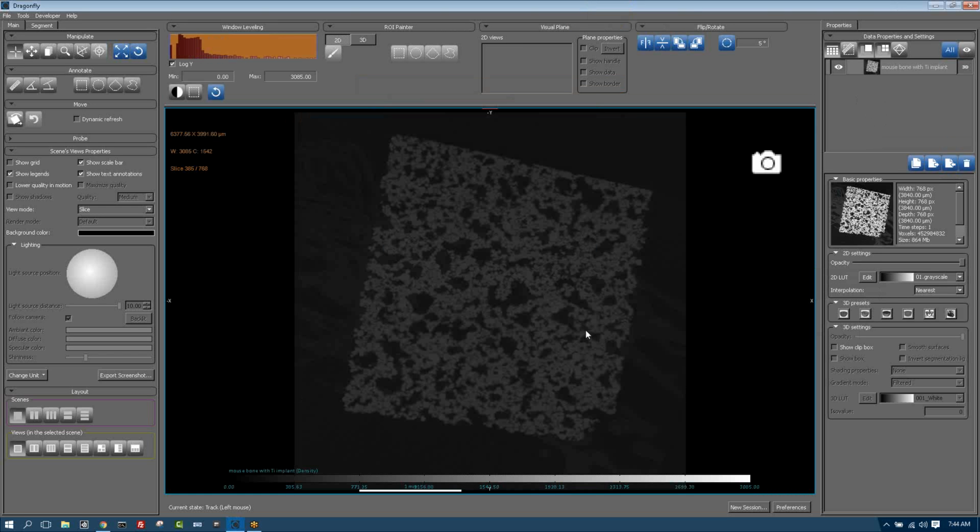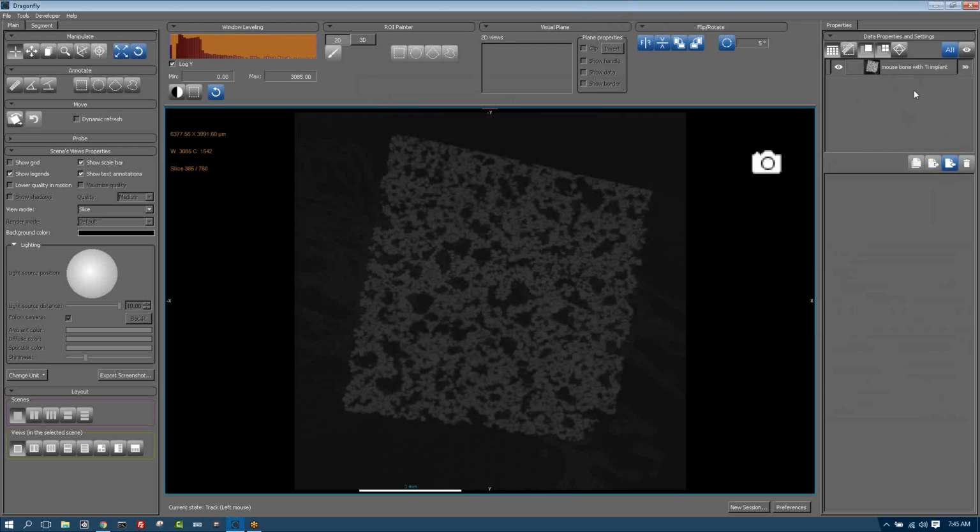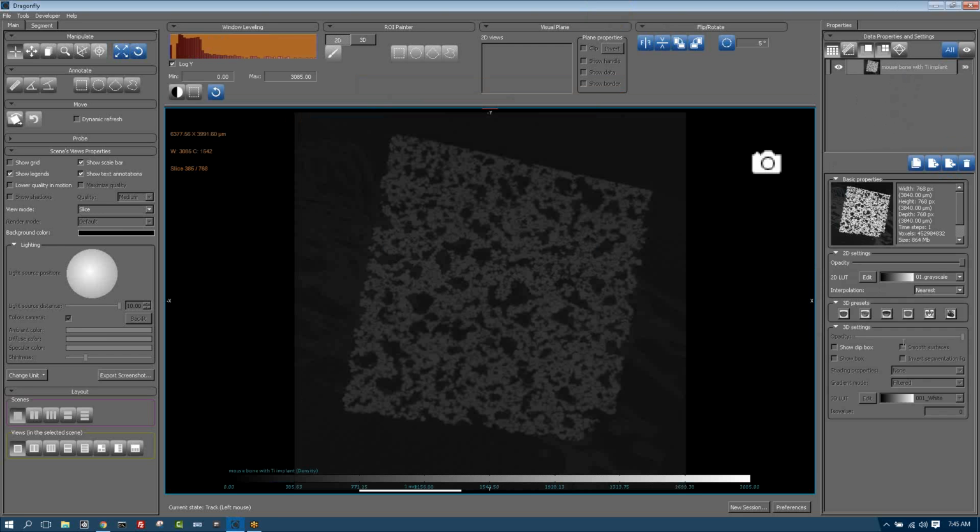So once you load a data set, you may have an environment that looks a little bit like this. Over on the right, you see I have a data set listed, and I can click off of it, or I can click on that object in the list, and then I see its attributes. So here's a snapshot of this particular data set.